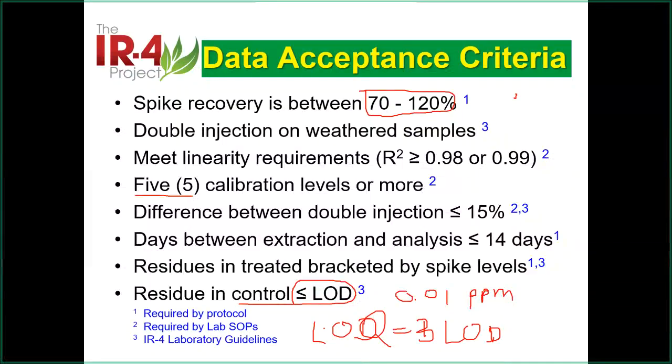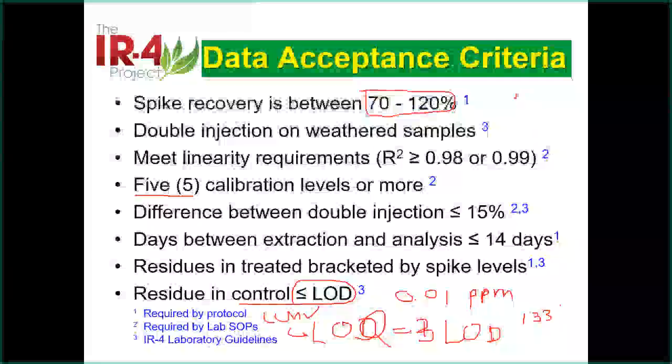So if the control equals LOD, your recovery at LLMV, if you would get 100%, will easily be 133% recovery, which is not acceptable.